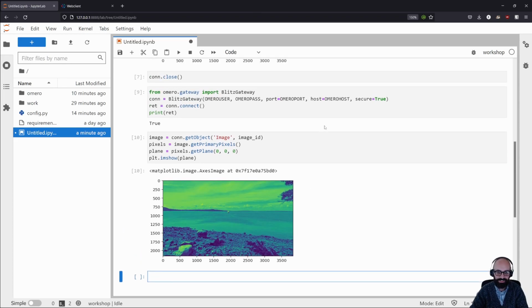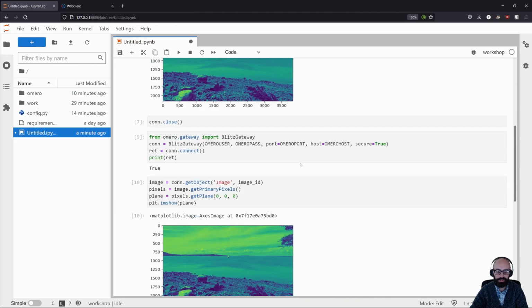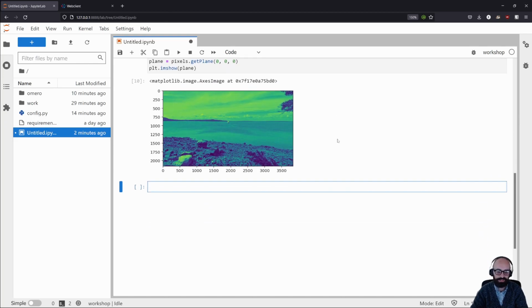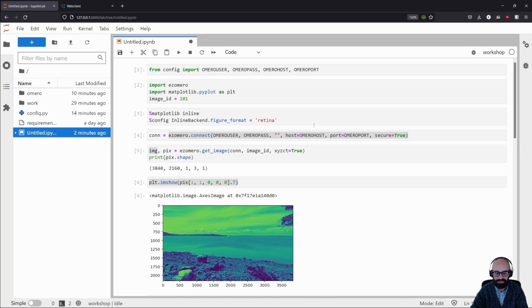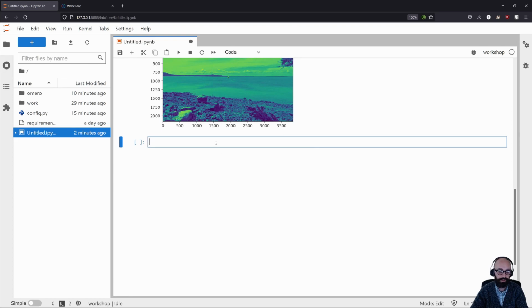You see that what took us basically 3 lines to do here, I'm going to ignore the importing here, but it takes like 1, 2, 3, 4, 5, 6 lines to do here. So it's twice as much code. And of course, in this case, it's between 3 and 6 lines, but if you're doing something bigger, all of a sudden, and this was the simplest case where you just want a single plane. Finally, don't forget to close your connection.